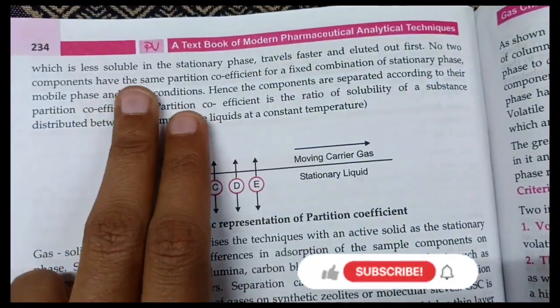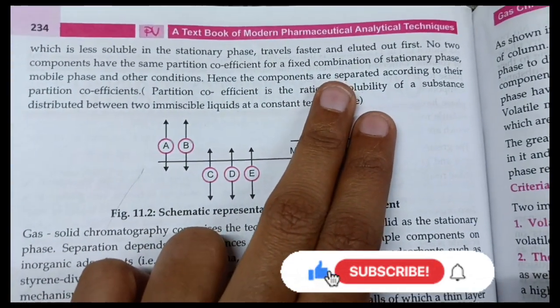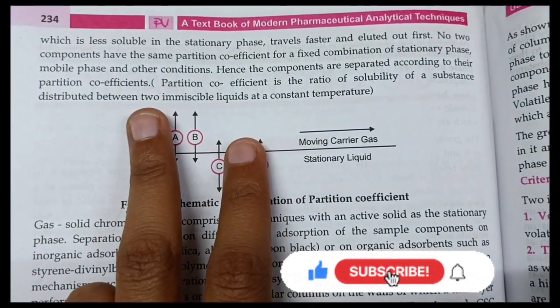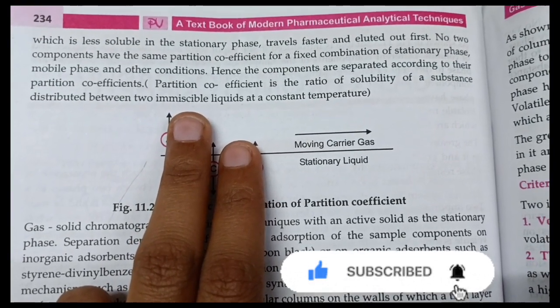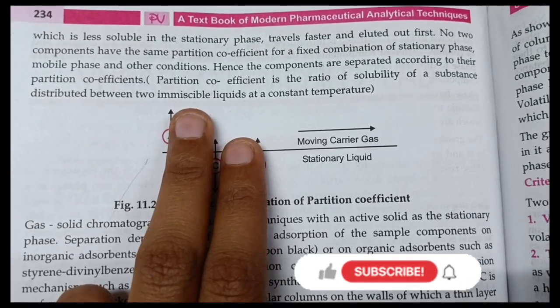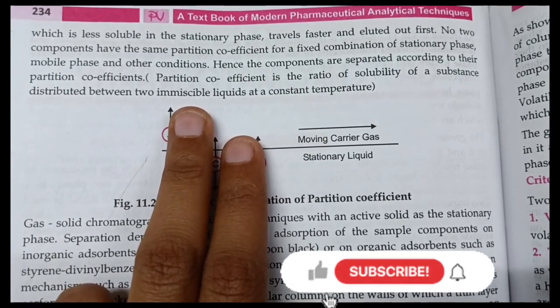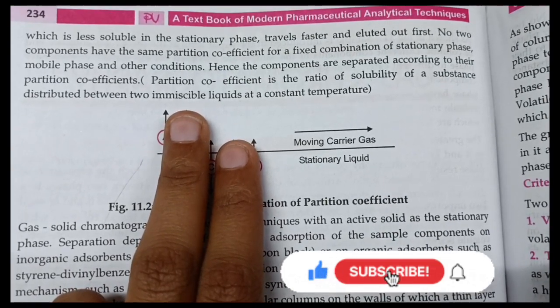No two components have the same partition coefficient for a fixed combination of stationary phase, mobile phase and other conditions. Hence the components are separated according to their partition coefficient. Partition coefficient is the ratio of solubility of a substance distributed between two immiscible liquids at a constant temperature.